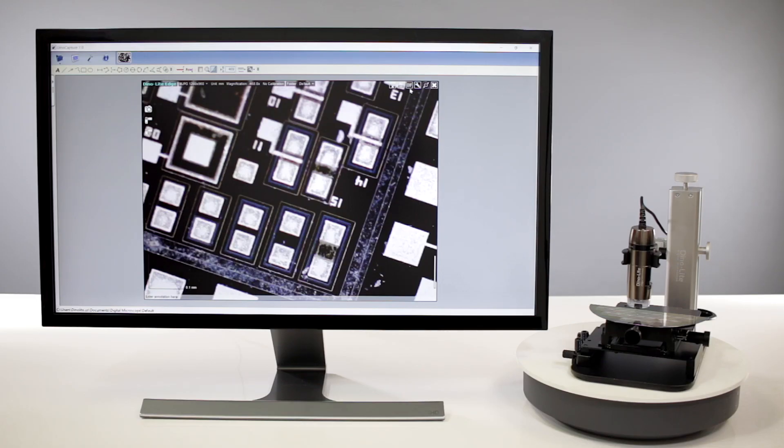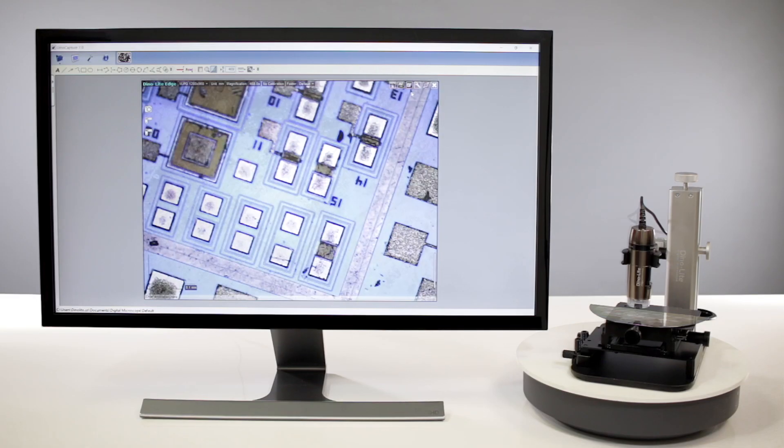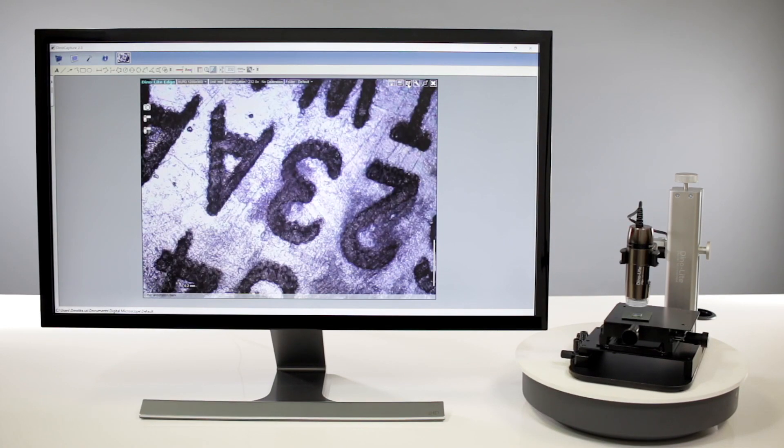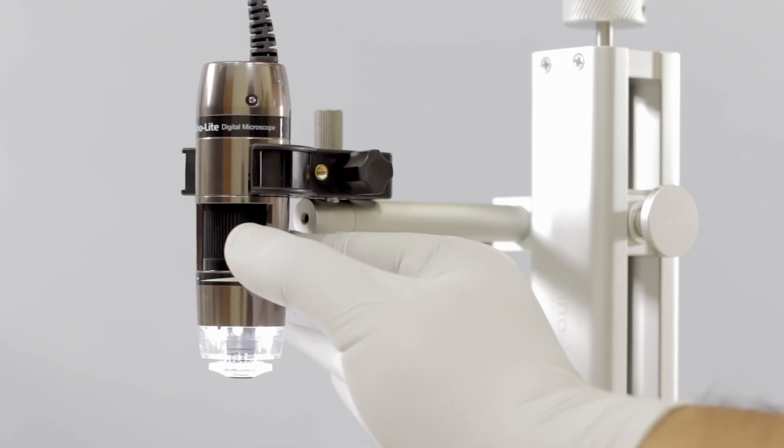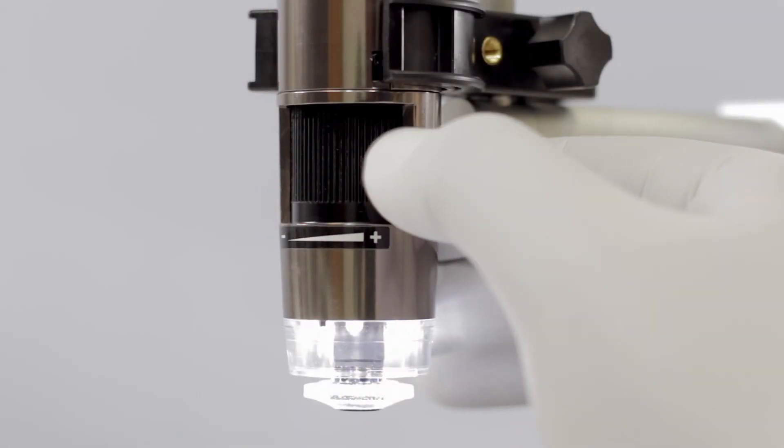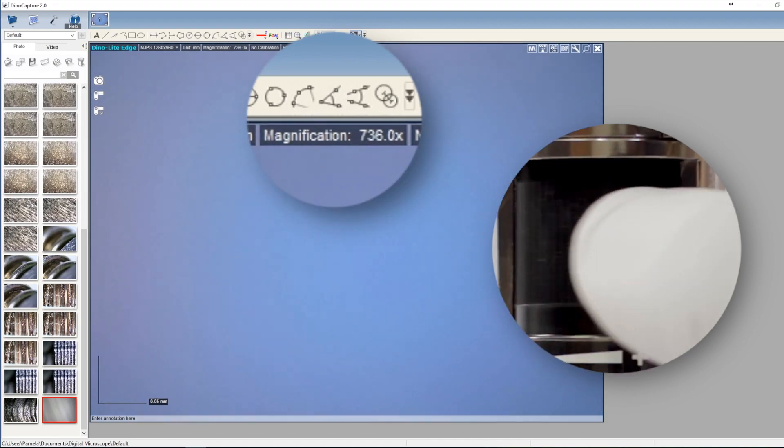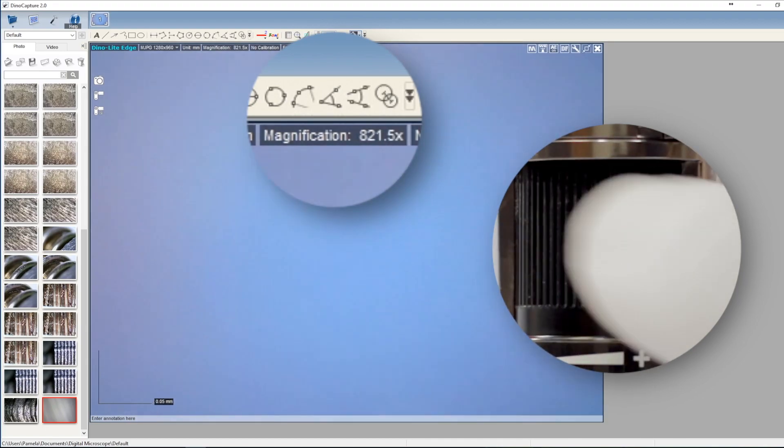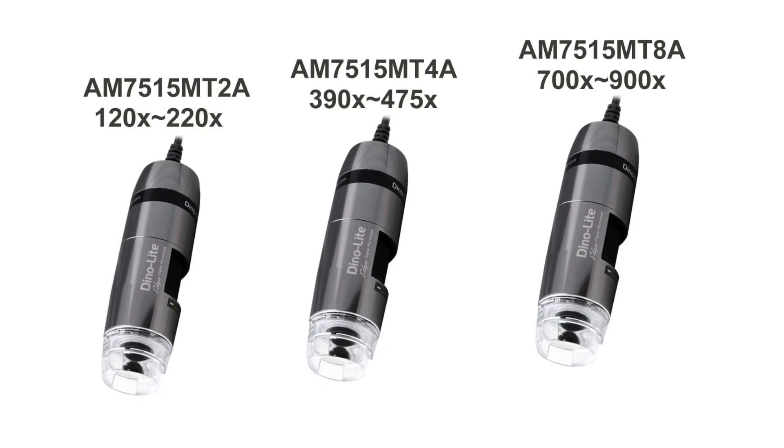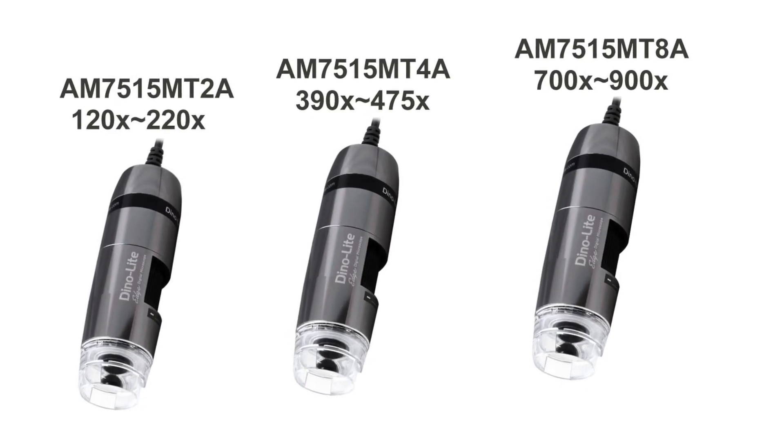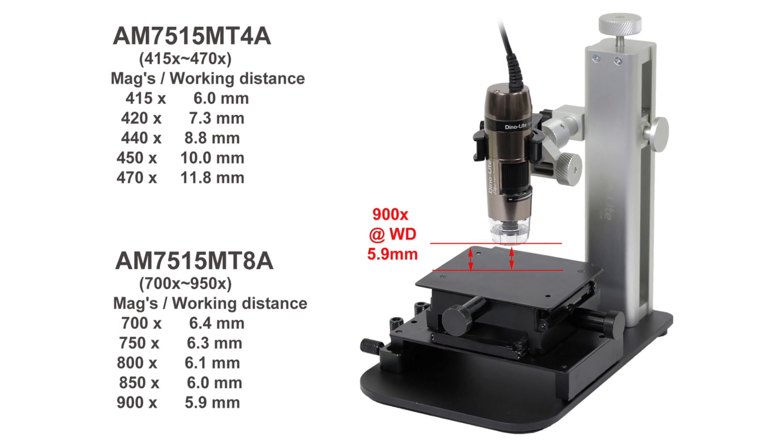These 5 megapixel Dynolite Edge Series microscope cameras feature built-in coaxial lighting in the same compact form factor of other Dynolite models. The three coaxial lighting models vary in magnification range only.